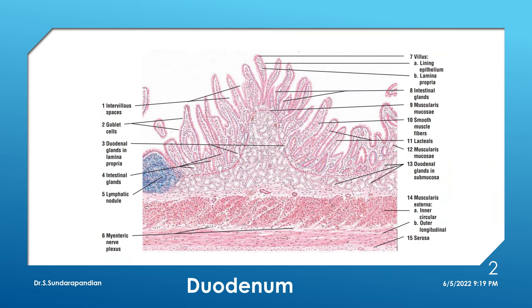So the first slide we are seeing here is the duodenum. For the basic four layers of GIT, that is your mucosa, submucosa, muscularis externa, and serosa — all four layers are present. So it is a slide of the GIT.